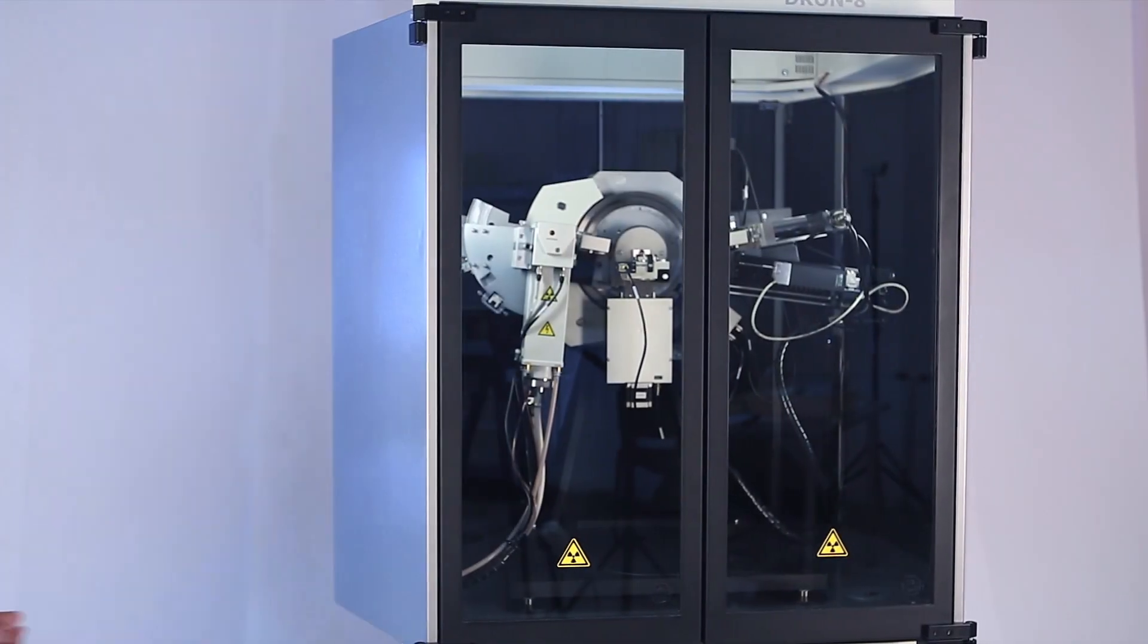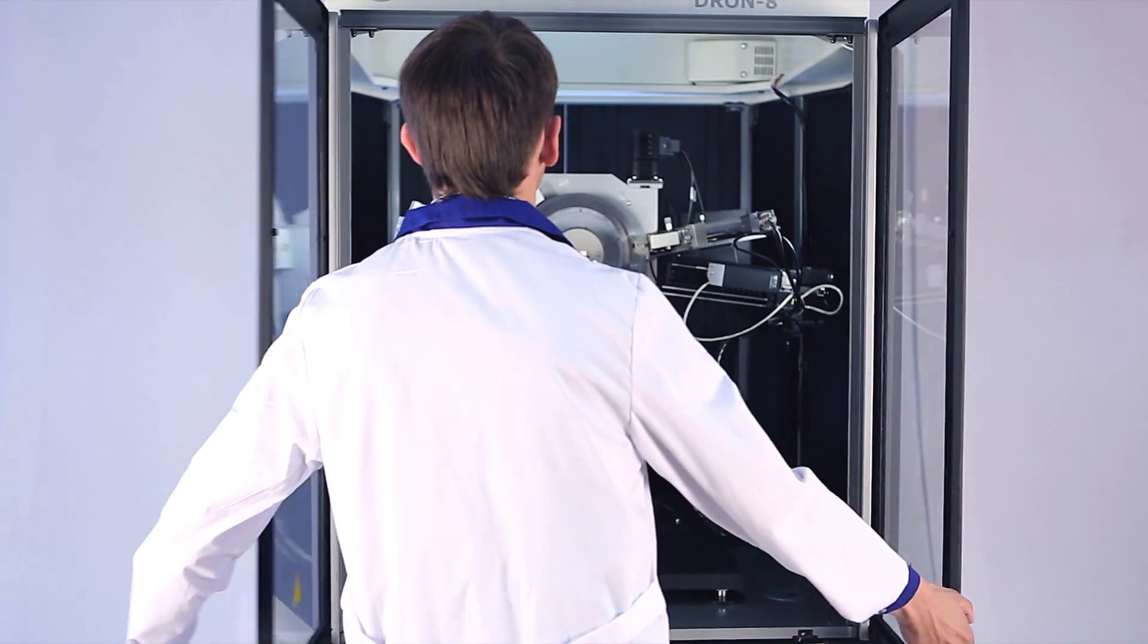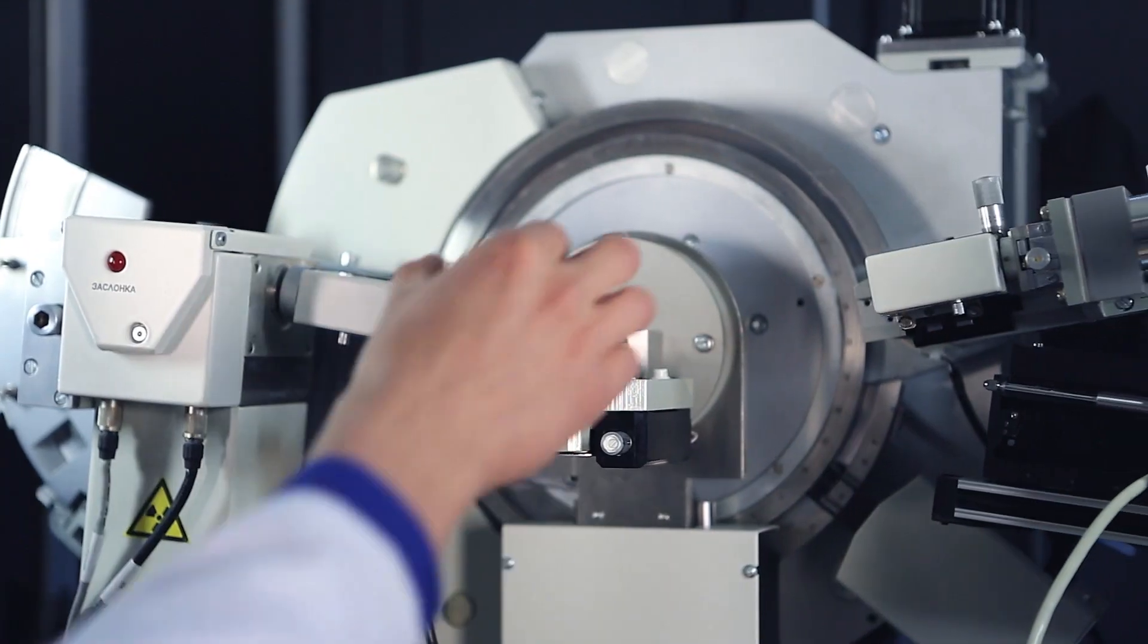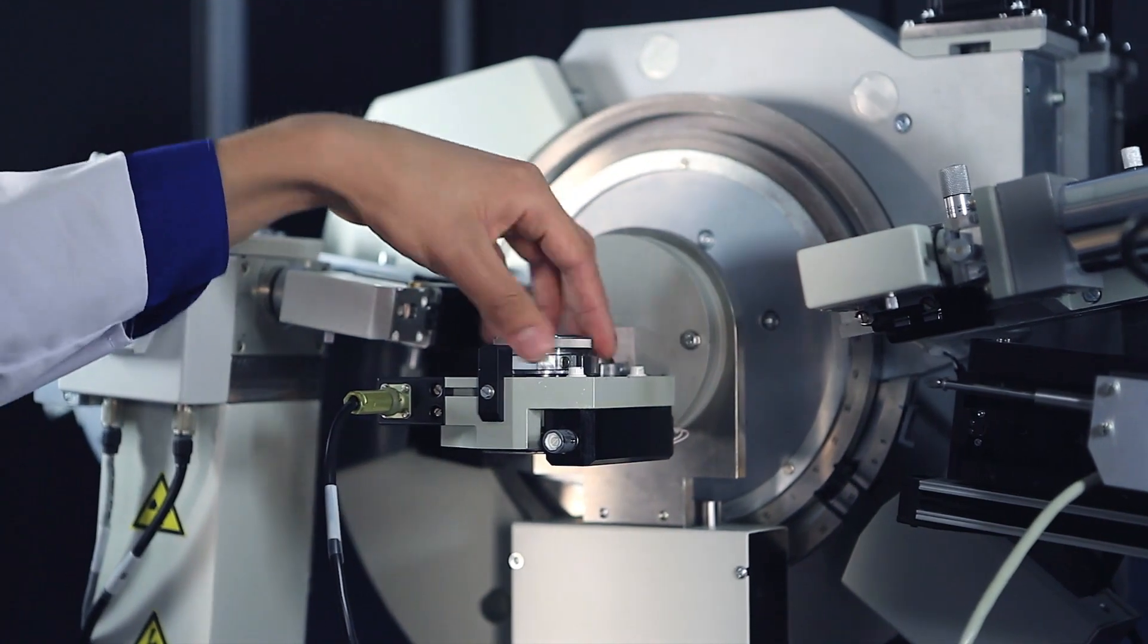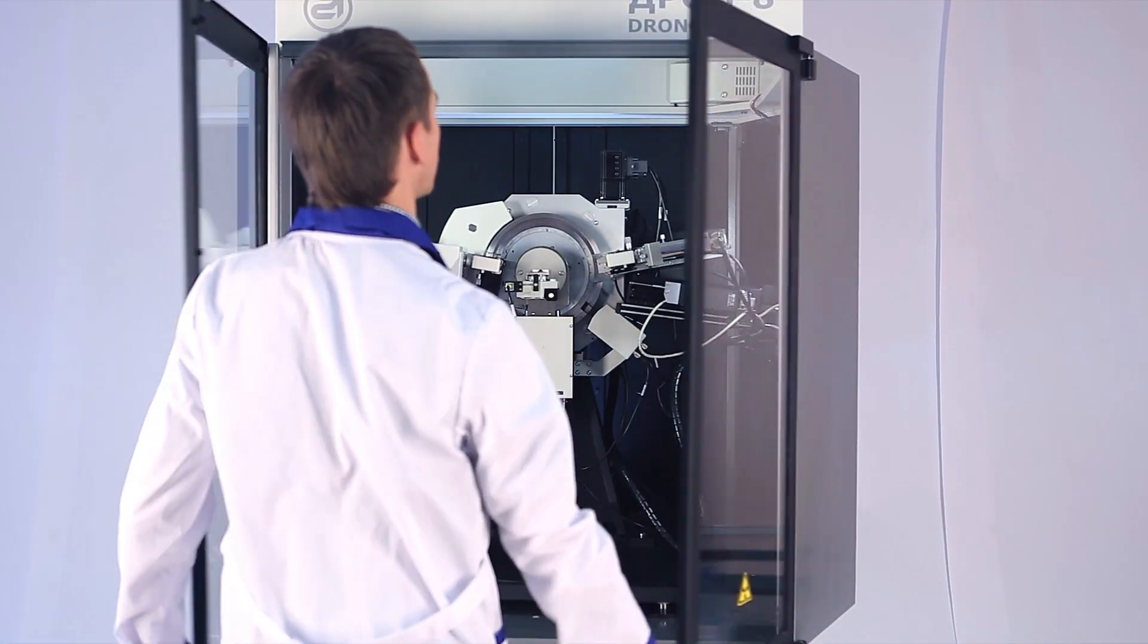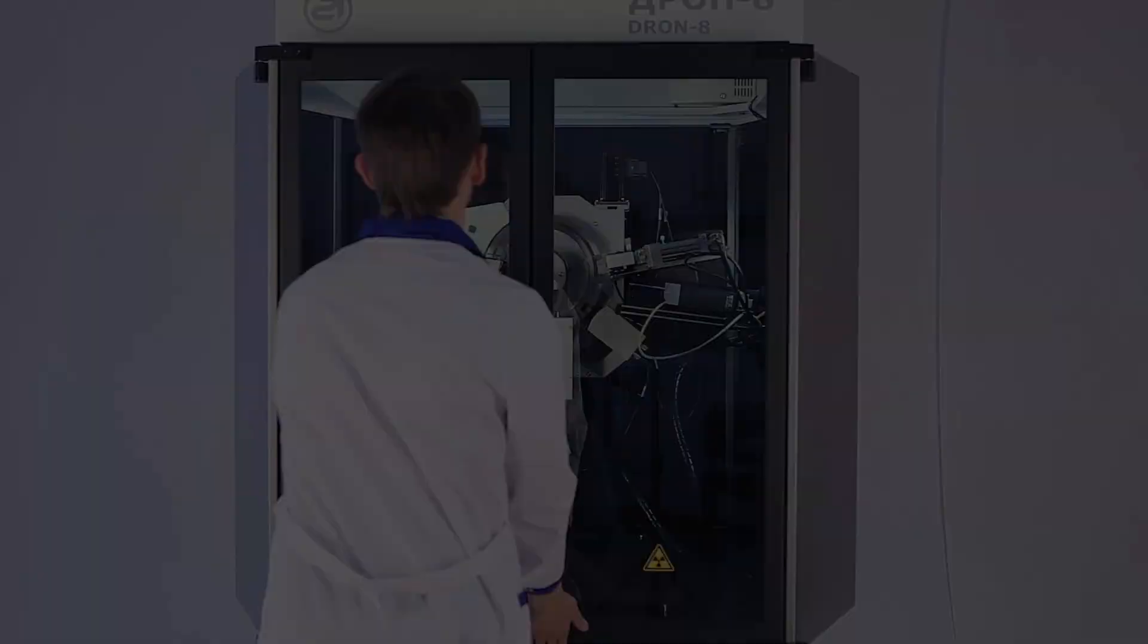The diffractometer is equipped with vertical theta-theta goniometer. The sample always remains in horizontal position during measurement. It provides examination of samples in different physical states with different dimensions and shapes.